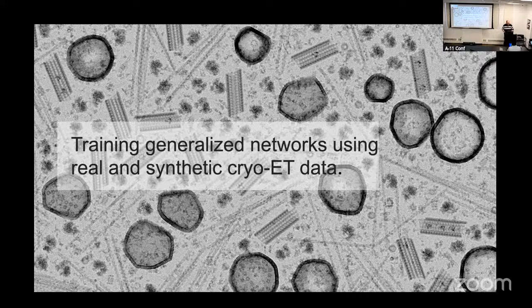They were all relying on me to analyze this data. And so when I realized what my role was, we started turning towards segmenting tomograms and trying to build cellular models. I try to think of it now like fitting an atomic model into a density map. We're trying to build the best models of the tomograms we can so that we can come back to them with the computer and ask questions about what's going on in that scene.